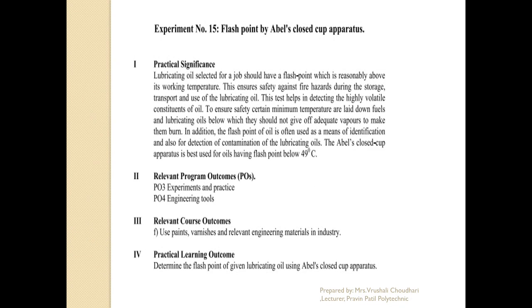In the Abel's closed cup apparatus, we use oils which have a flash point below 49 degrees Celsius. The relevant course outcome is complied with by this experiment.